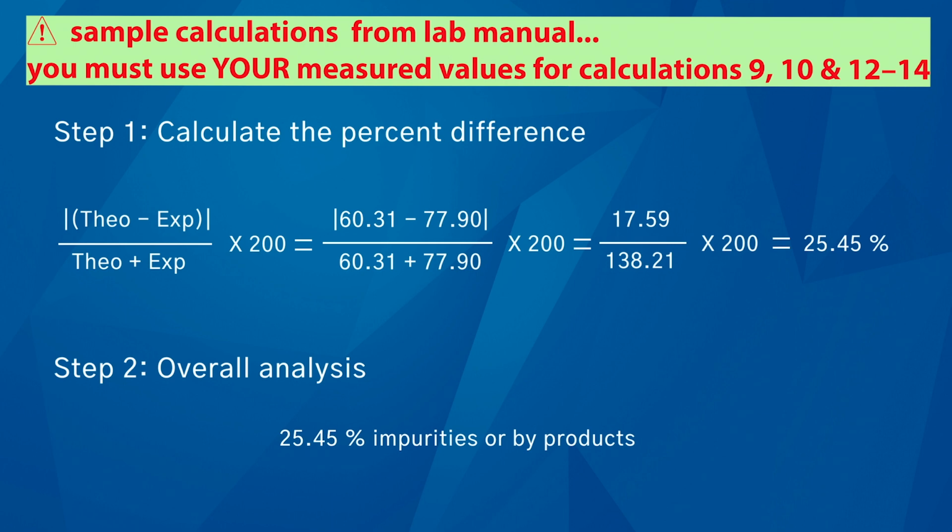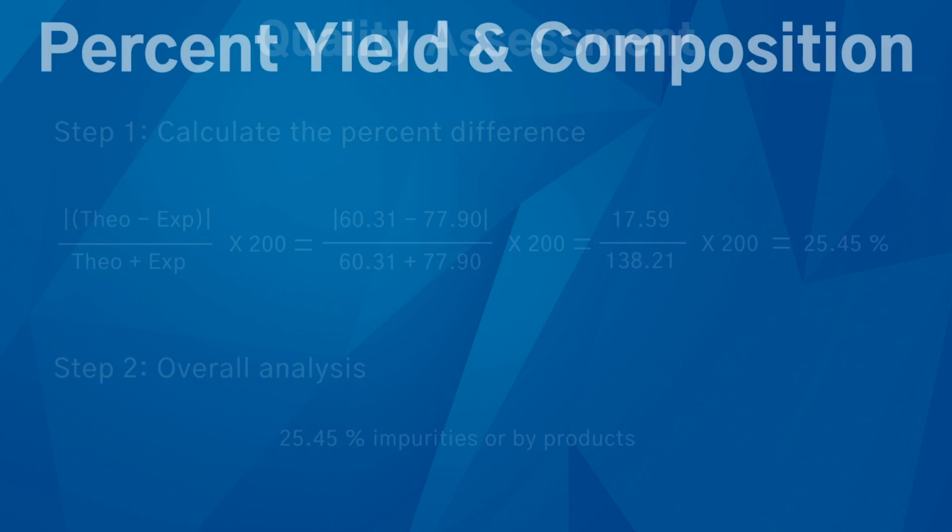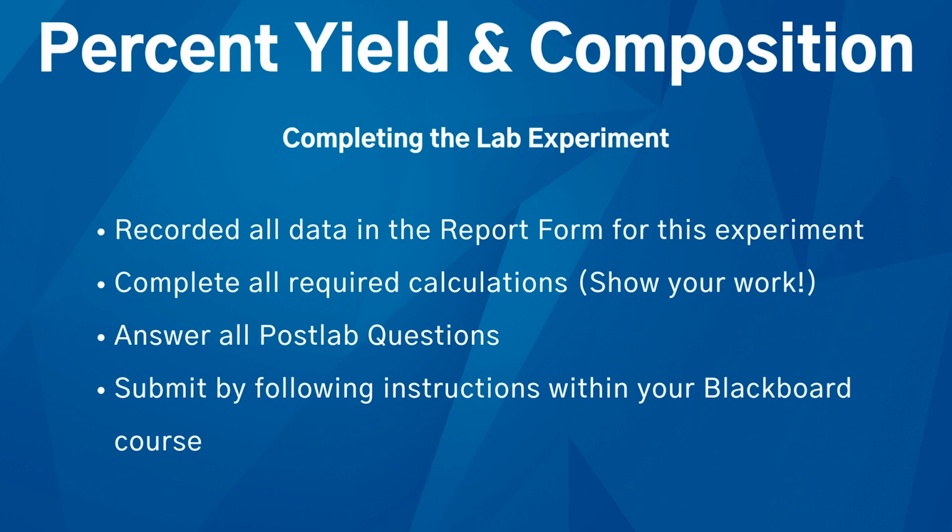And so with that, you have your experimental data and you have sample calculations as to how to process that data. All that remains now is to put the two together, make your calculations, and report it in the report form, as well as the post-lab questions.